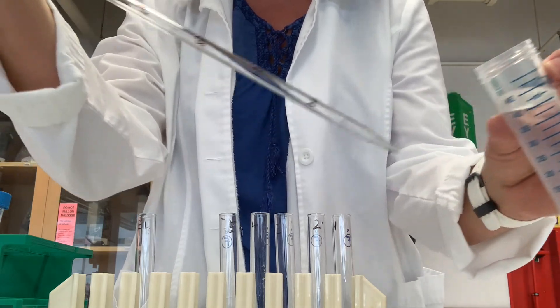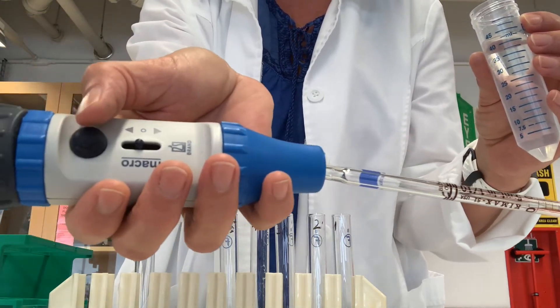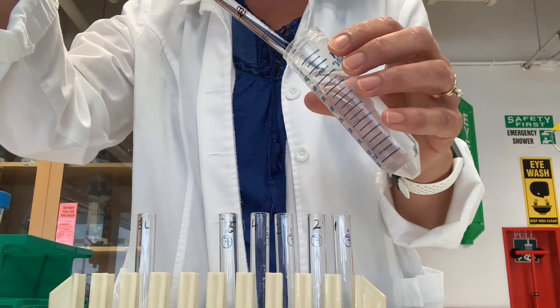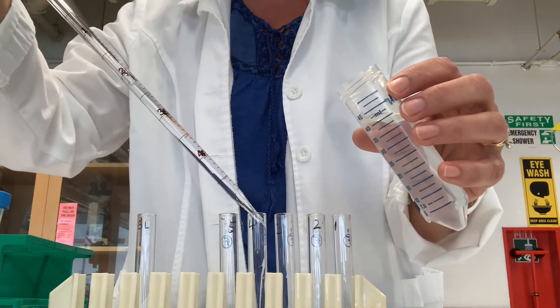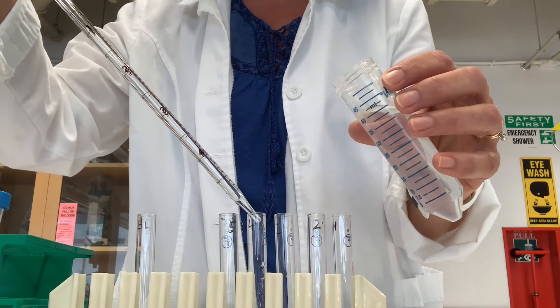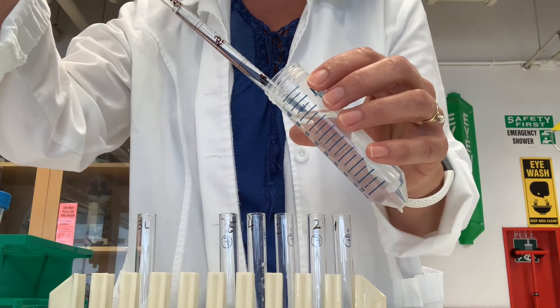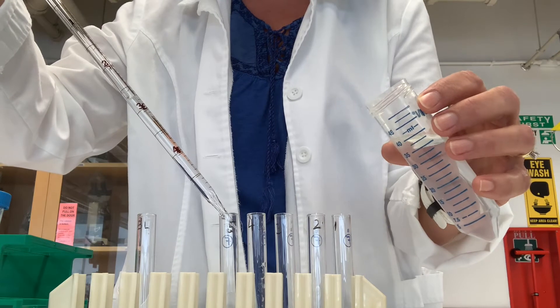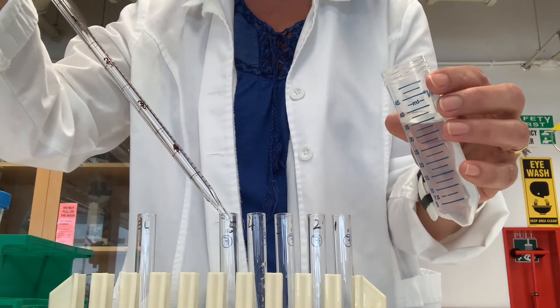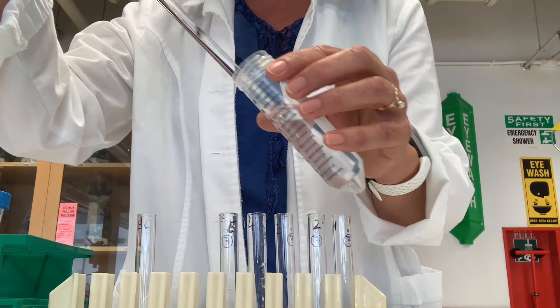When blowing everything out of the tip, we don't want any liquid remaining. I'm pressing the button to blow everything out. Here's our delivery of three milliliters into tubes two through five. I will now add six milliliters of water to our blank tube.